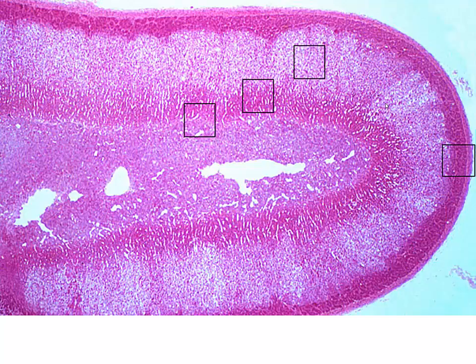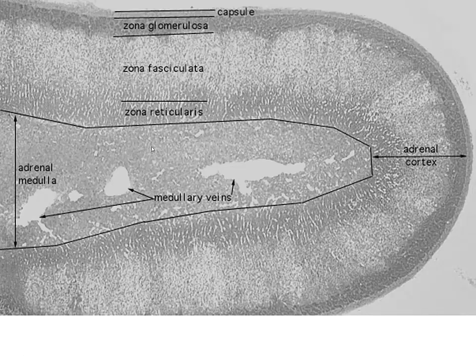So we're going to continue to go up in magnification, continue to look at these 4 layers, 3 cortical, the 1 medullary. On the surface, here we can see our subcapsular space. This is where we're going to have that plexus of blood vessels that stream down through the cortex. But here again, we can see our cortical trilaminar. We've got the zona glomerulosa, the zona fasciculata, the zona reticularis, before we get to the medulla. And we'll look at those more closely to really get an appreciation for the histological characteristics of each.